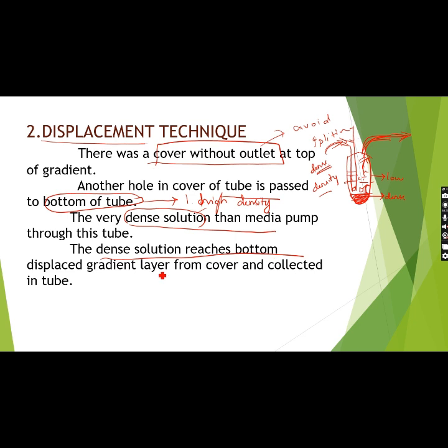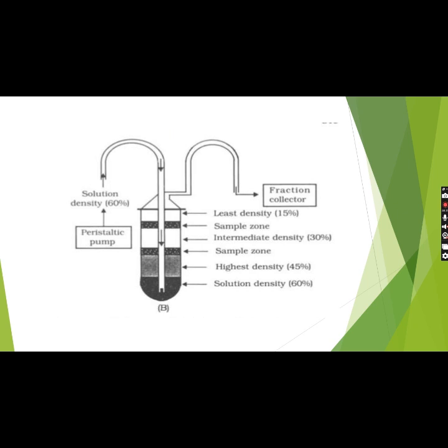So the dense solution is going to reach the bottom, which causes a displacement of the gradient layer. So here we can see that there is a peristaltic pump which is very important for pumping of the solution.